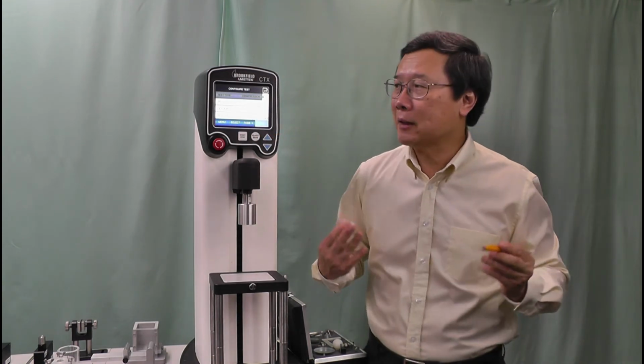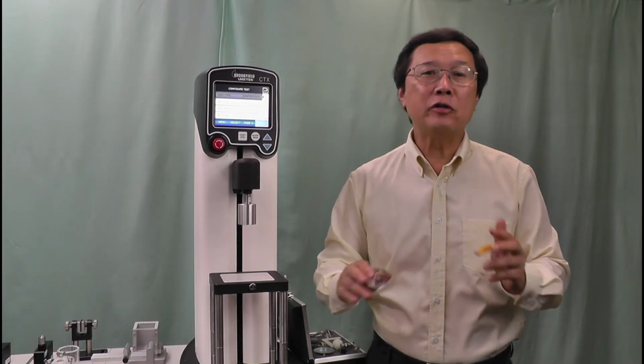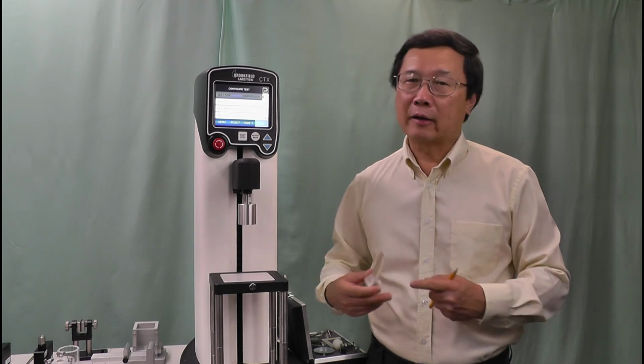So here I am, very important. When you write a test method, trigger means when to start. Deformation means how far you want to go down, or how heavy. And then speed, how fast. So that's all you need to know: when to start, how far, how fast.